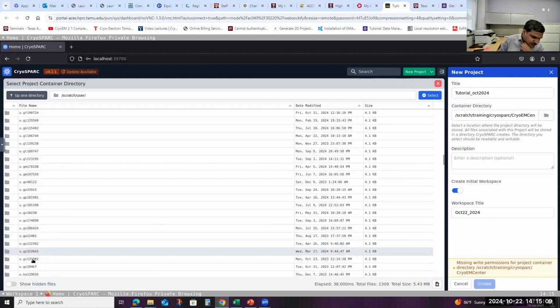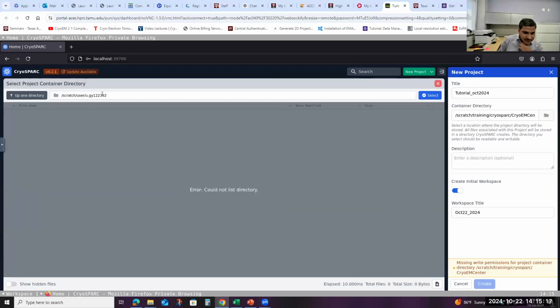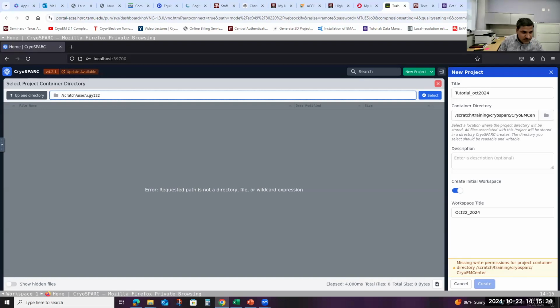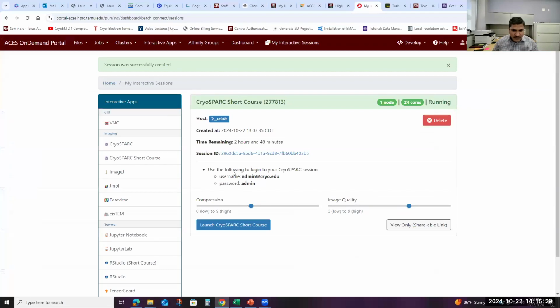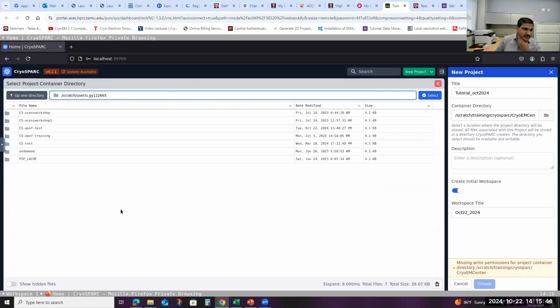This one, there are two GY. Your GY122. 122. Okay, let's see here. u.gy122. 122.665. Okay, sorry, thank you.